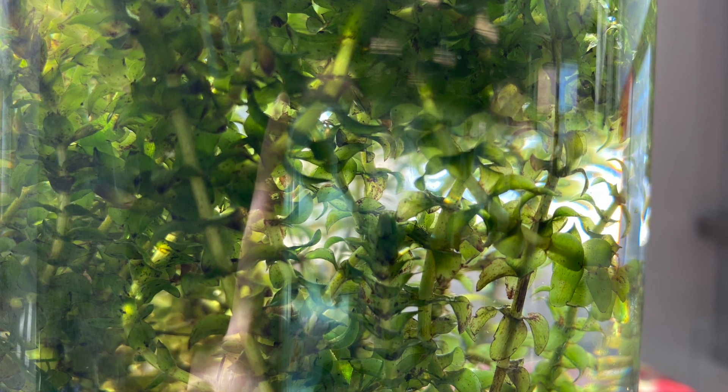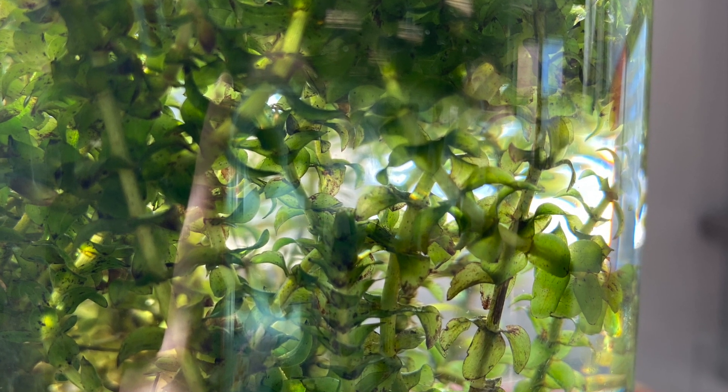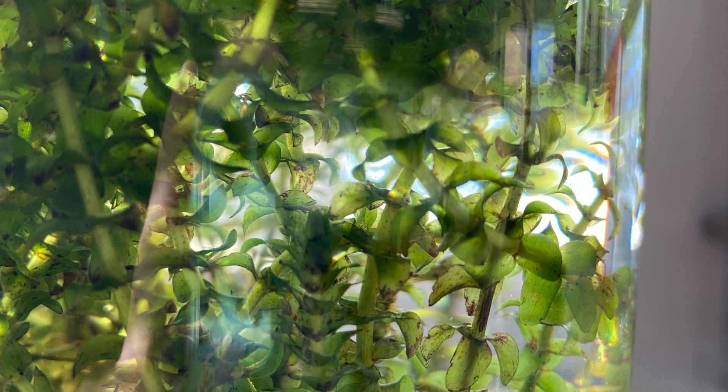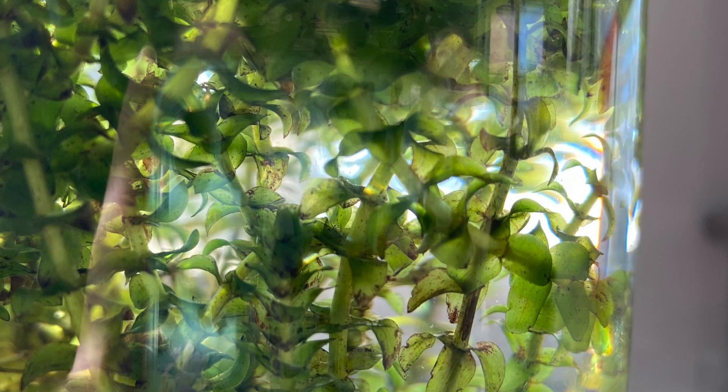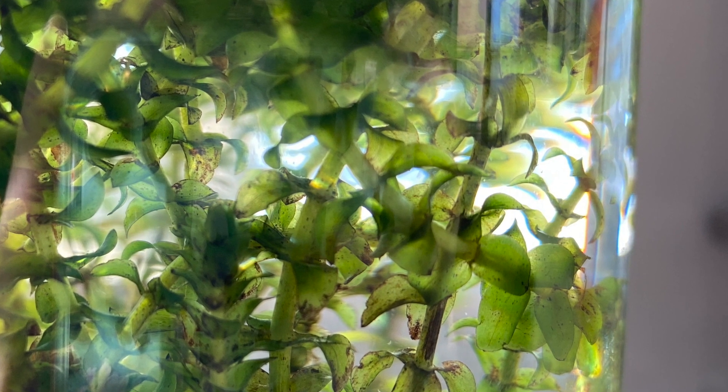The reason why we use Elodea for this lab is because the leaves are not very thick. In fact, you can just pluck off one leaf and you would be able to see the cells of a plant. If you did this with a different type of plant, there are several layers of plant cells and you cannot see the individual cells.